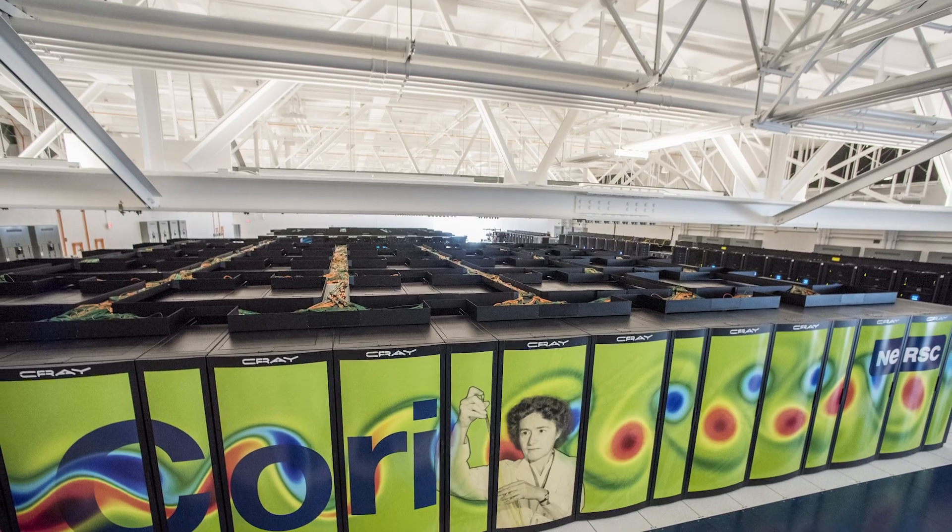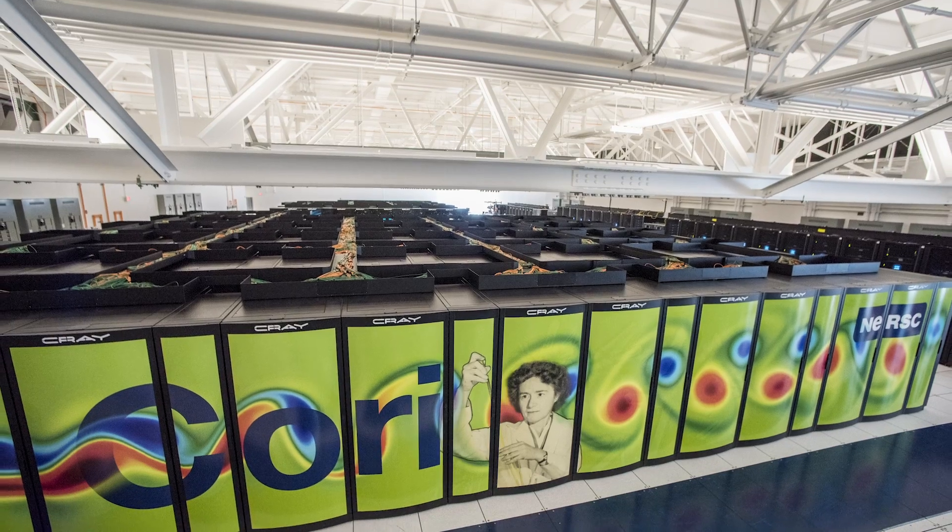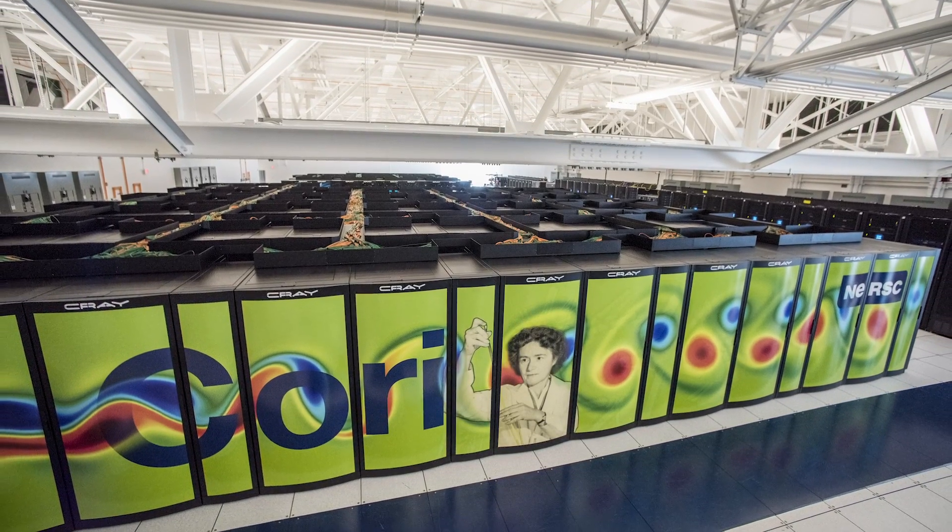So how do we collect, analyze, and store all of this data? The detector is directly connected to Berkeley Lab's supercomputer called CORI over 96 optical lengths that are about a kilometer long.